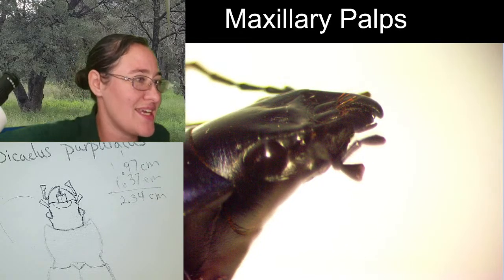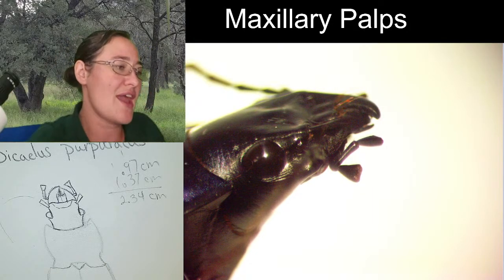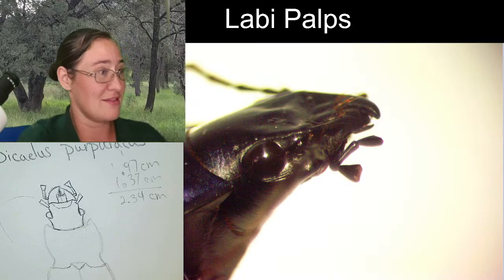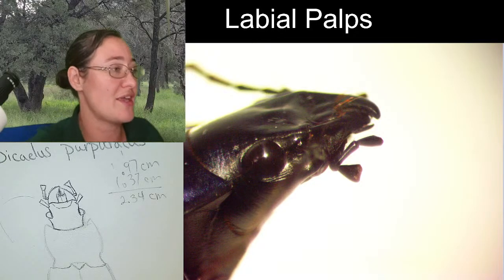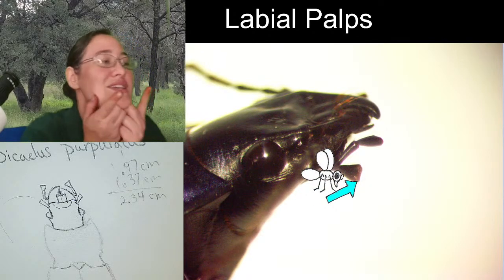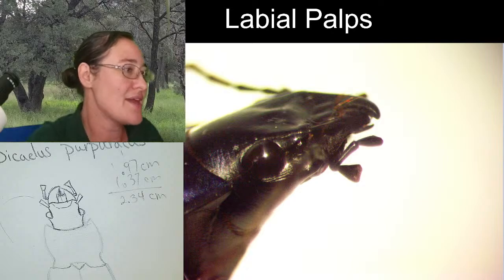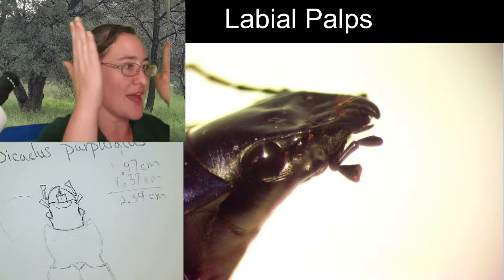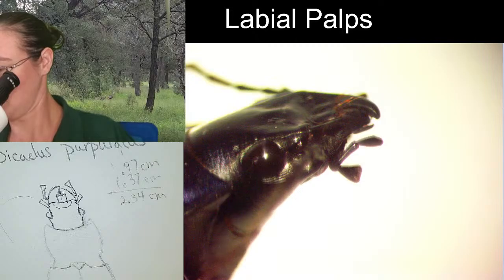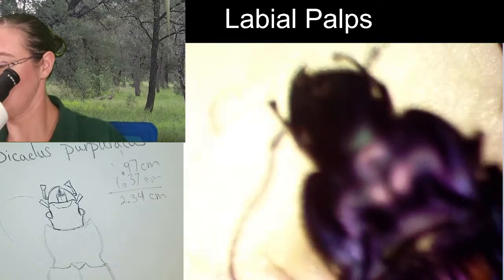You can see, in this viewpoint, the labial palps. So they have two sets of palps. The maxillary are the larger ones, connected right underneath the mandible. And then the labial palps are connected to the bottom jaw here, and they're kind of short. They're right about here. And that little segment right there is just a little bonus mouth finger that kind of does this to push the food into their mouths. And from this view, you can definitely tell that that eye is situated on a very lateral kind of plate here. Just so pretty.